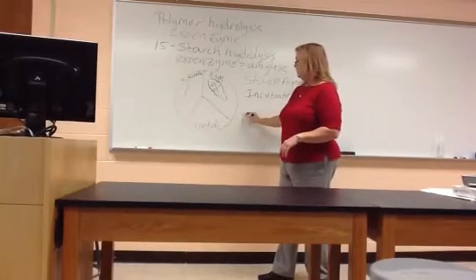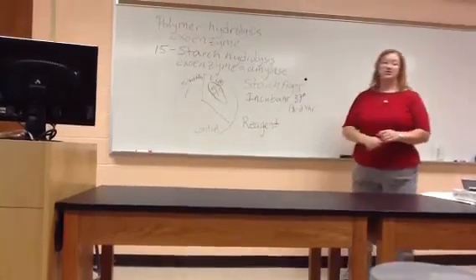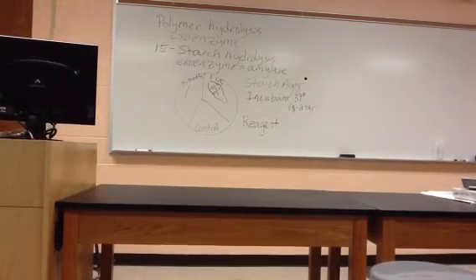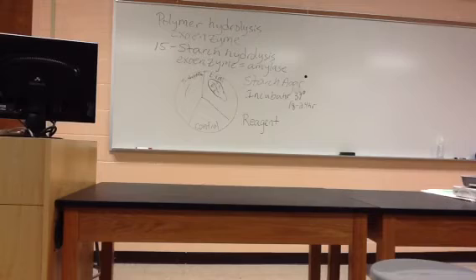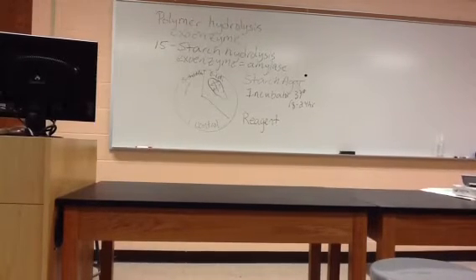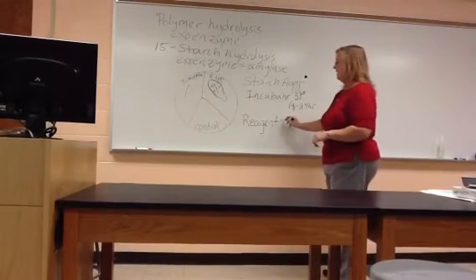So to make it easier, after incubation, we're going to add a reagent. That word reagent by itself, it's a chemical that we're adding to help us determine positive from negative results. The specific reagent we need for this test is iodine.